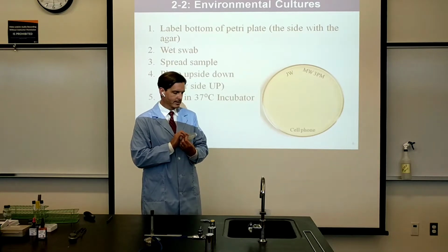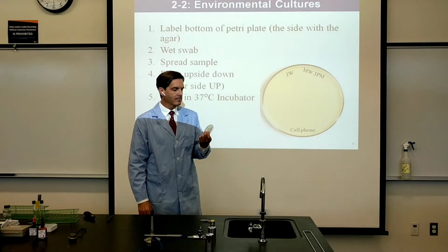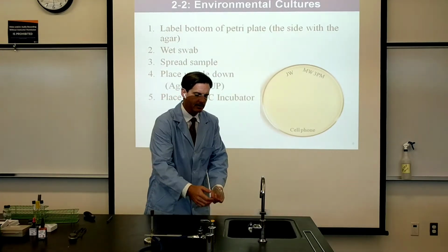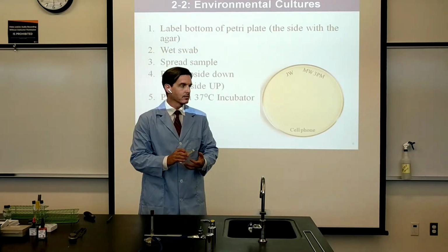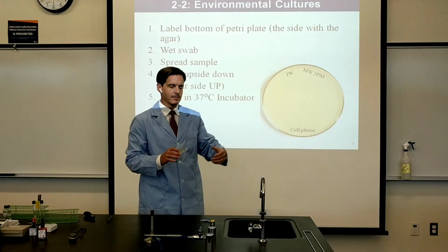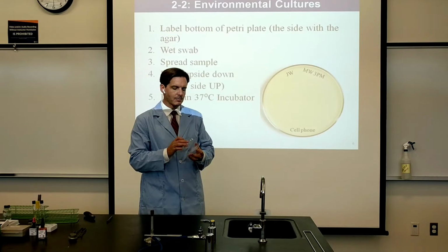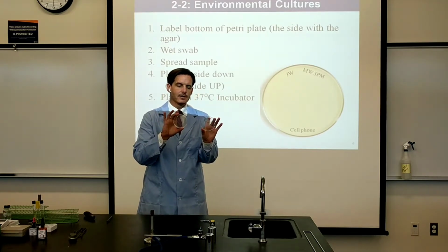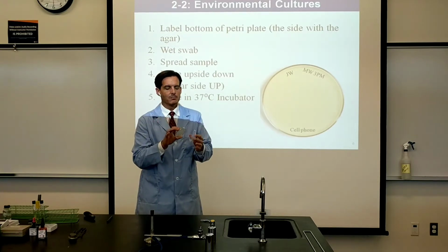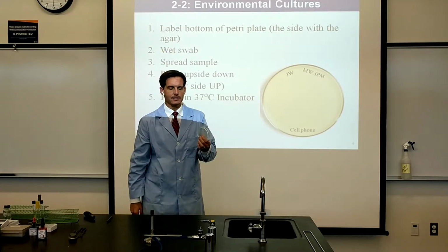One of them was a 20-minute air sample. And the 20-minute air sample was just out here on the desk in the first video. And the air in here is pretty still. I do know that there's some movement from the air conditioning, but surprisingly, the plate has nothing growing on it. Certainly that doesn't mean that the air inside of MicroLab is sterile, but it is nice to know that at least it's not blowing around a bunch of dirt and dust.